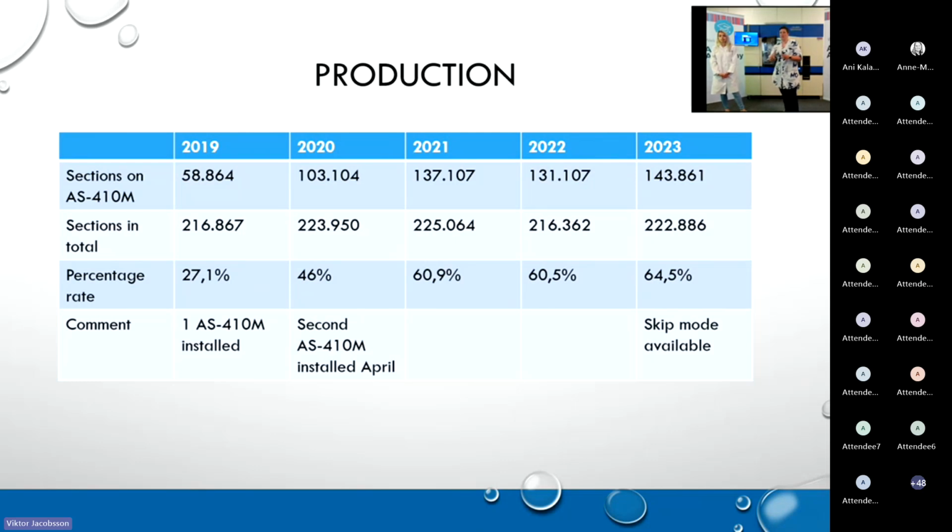And that thing that we had to scan all the blocks twice means that when we started a full load, for example, we were using 20 minutes of our time for scanning blocks instead of just starting the cutting right away. So that time is now being reduced, and now we can cut even more.